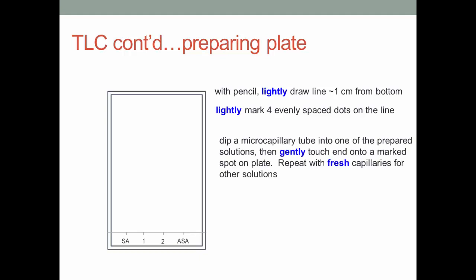To get your sample onto the plate, dip a microcapillary tube into one of the prepared solutions, then gently touch the end onto a marked spot on the plate. Repeat with fresh capillaries for the other solutions.